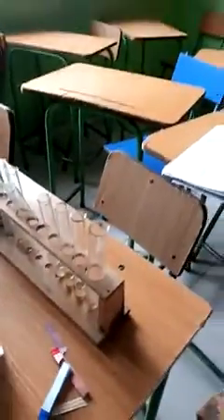So where are the portions? This is the portions now. One, that one is small. I will add a little more to it. Okay, so we now have our 3 portions. Alright, so we have divided C into 3 portions. So that's how to follow the instruction that is given.